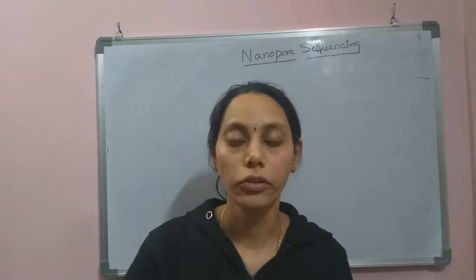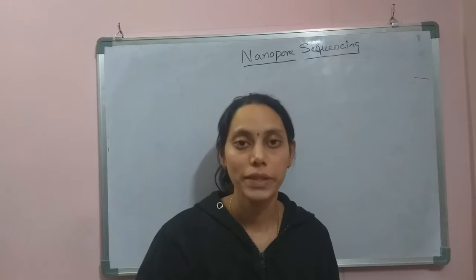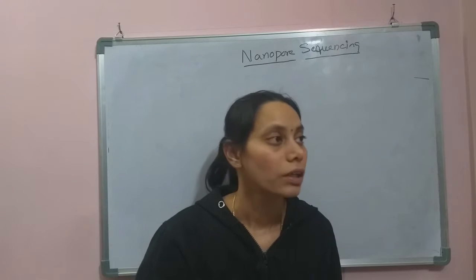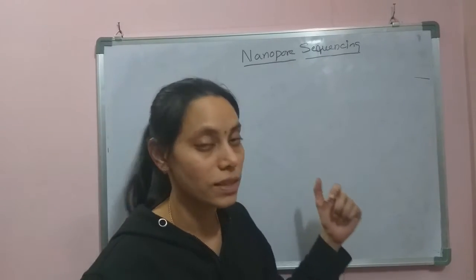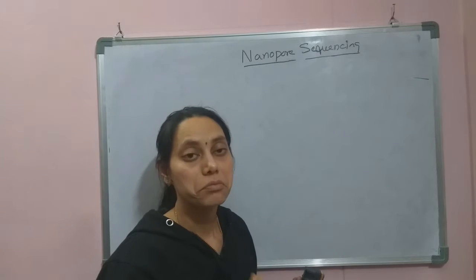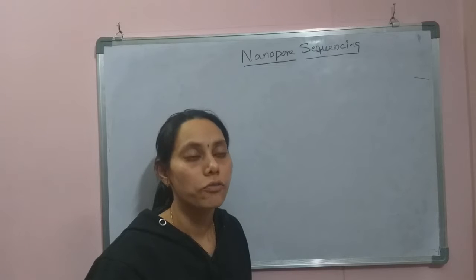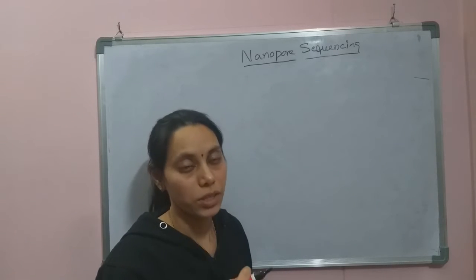In this video, we are going to discuss nanopore DNA sequencing. In this series of videos, we have been discussing different DNA sequencing technologies. As a part of that, we are going to discuss this nanopore DNA sequencing technique. We are going to have the basic idea of nanopore DNA sequencing, that means what exactly nanopore DNA sequencing is and how it works, followed by what are the advantages with it.